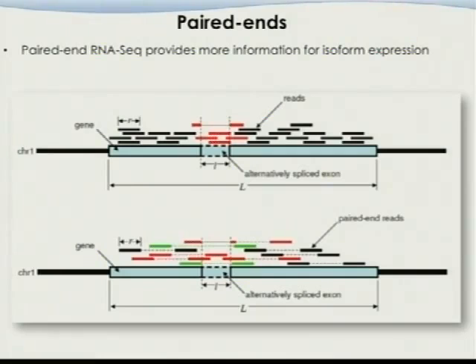So you can see that this is for single end, and this is an alternative splice region. This is intron retention, and there are some reads covering there, or sometimes there's a break here, but once you do the stranded paired-end assay, you will observe much more information, and in many cases that helps you to identify the gene structure much better. Okay.